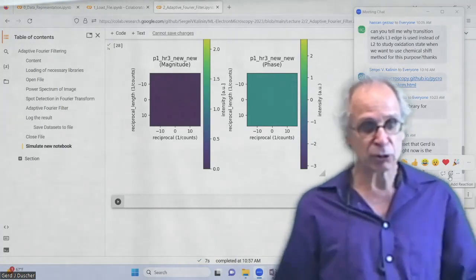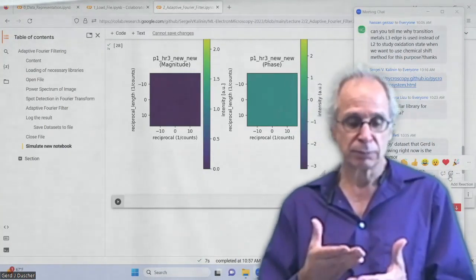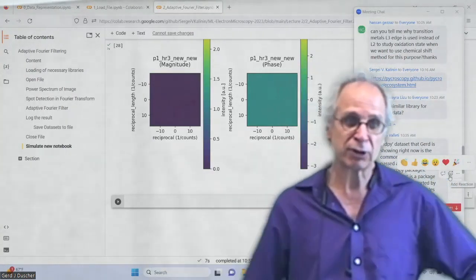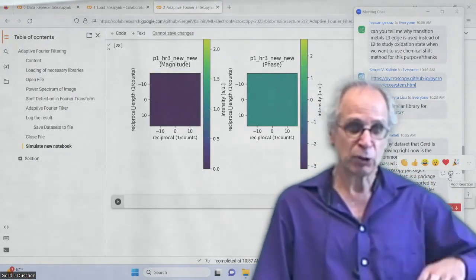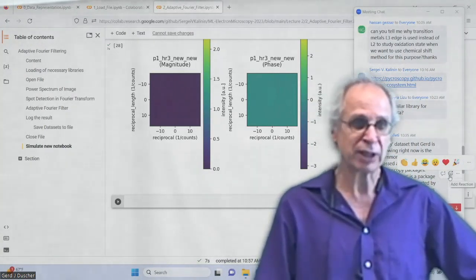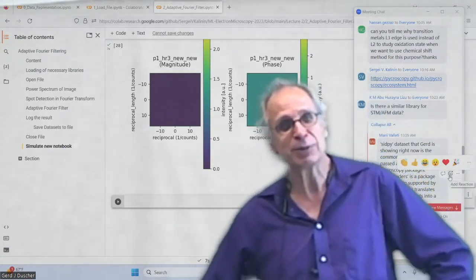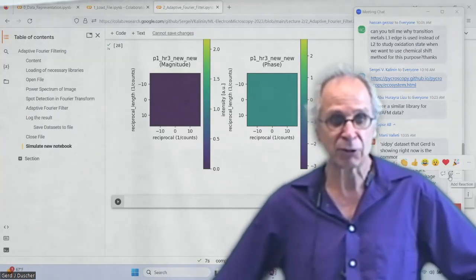So the idea is, of course, the machine learning tools are the first thing, just different dimensionality of data, and combining different techniques into that is key. So we do that here in this course for STEM. We do the same thing with AFM data. I do the same thing actually with DFT calculations. We get data out of that. We want to analyze them, and so it's supposed to be universal.